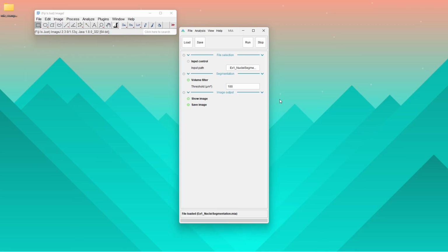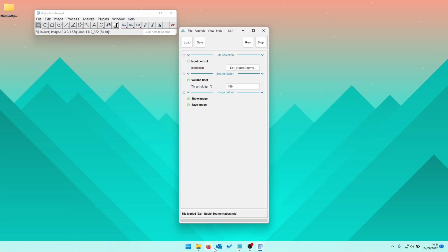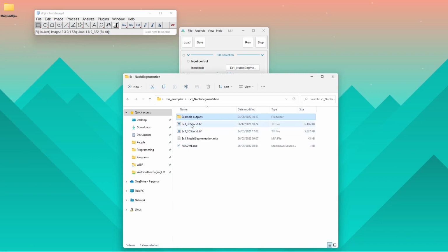And that's fine if you're processing maybe 1 or 2 images, but if you're in a big batch mode, I'd probably turn that off, because otherwise you're going to be inundated with images popping up. The second option here, save, will just save that to the same place as the input file. So in this case, it would be here, underscore, overlay, and I'd recommend leaving that on unless you have a particular reason you don't want the outputs being saved.